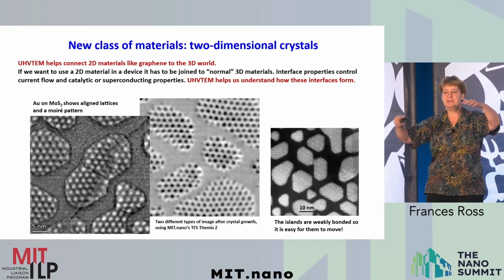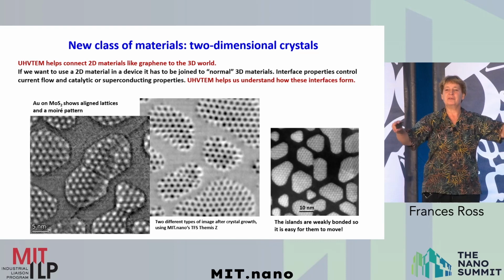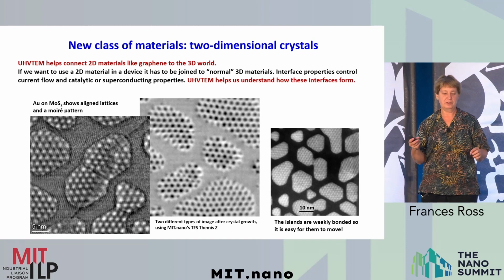They're in phase and then out of phase, then in phase, and that results in the strong contrast in the microscope. And again, at higher resolution, you can see them moving around at room temperature. Do you see the little jiggles in that last movie? The gold atoms are not well stuck down onto the 2D surface.